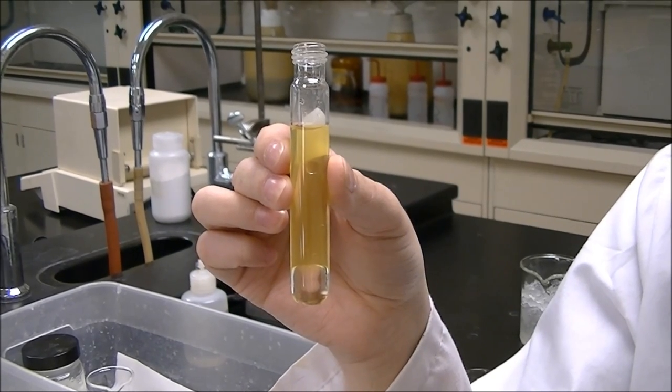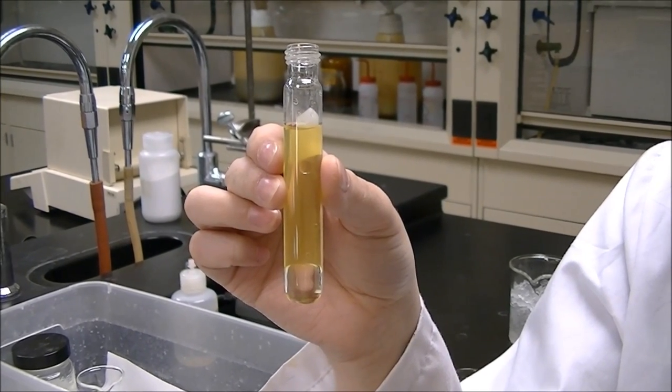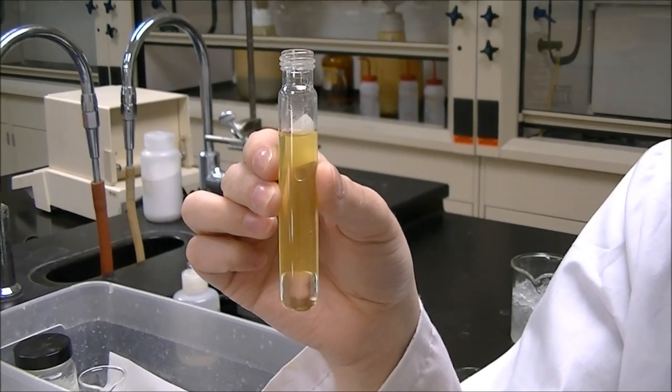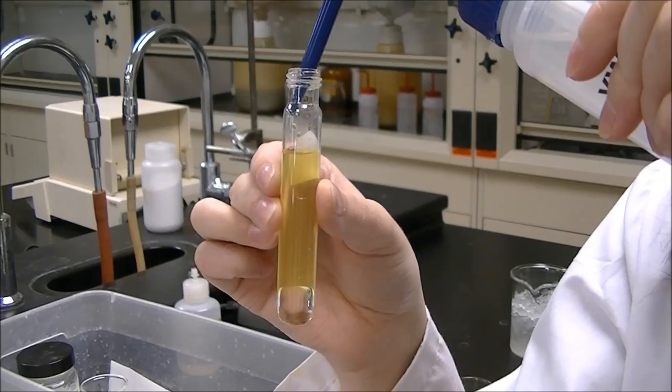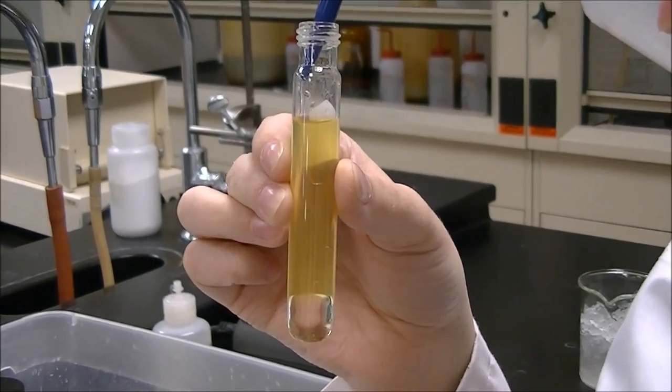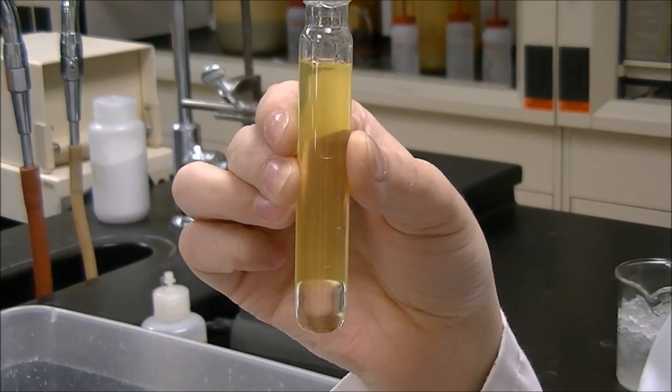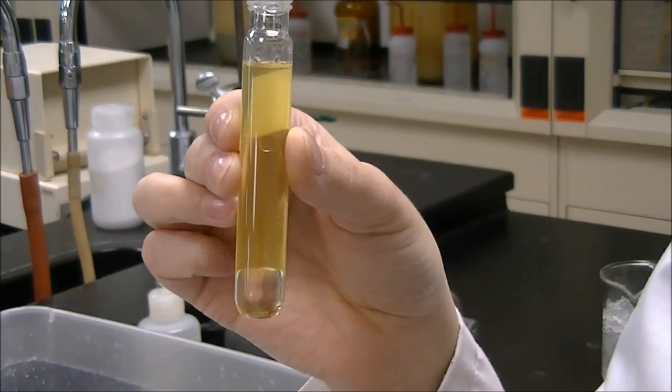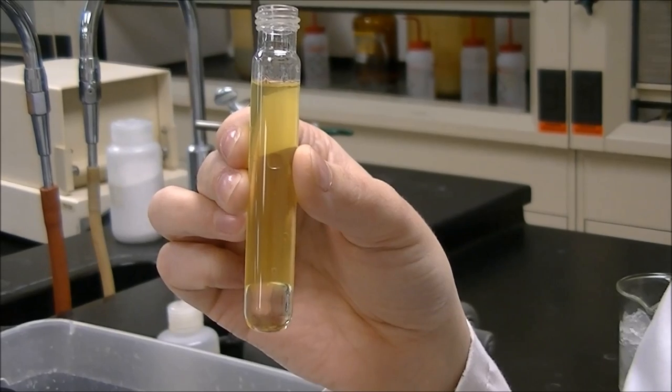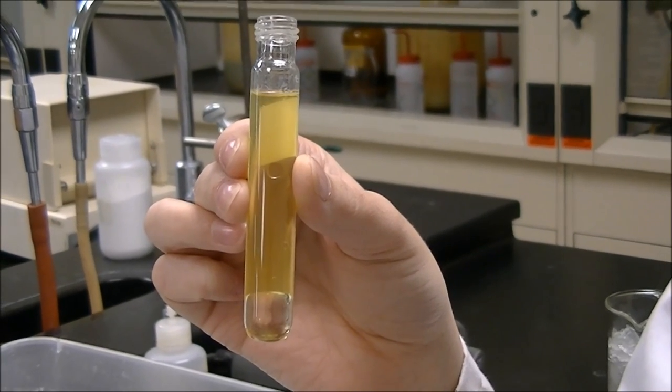If you had the densities of the two solutions, you could figure that out, but you actually don't even need that. What we're going to do is we're going to add some water, and whichever phase grows in size is the aqueous layer. You'll see that that yellow layer is getting taller, but that layer at the bottom is not. So the bottom layer must be the organic layer, and that's the one that we're going to pipette out.